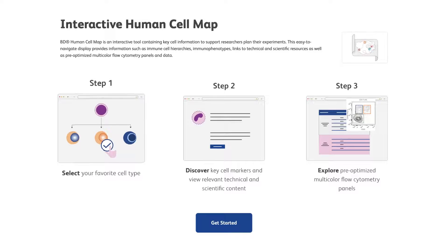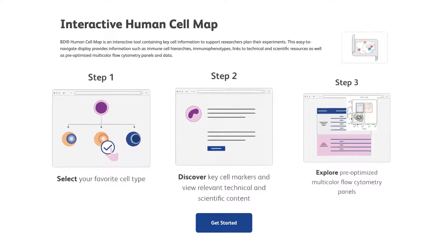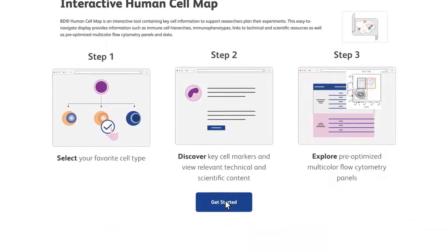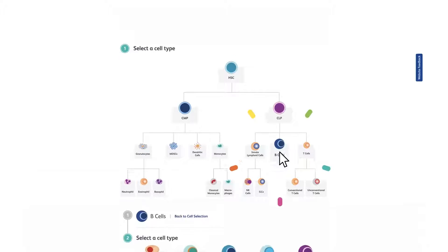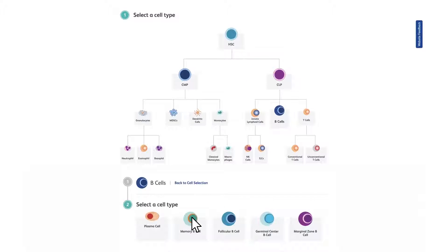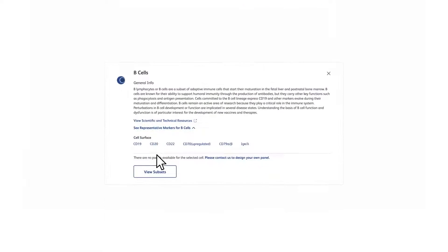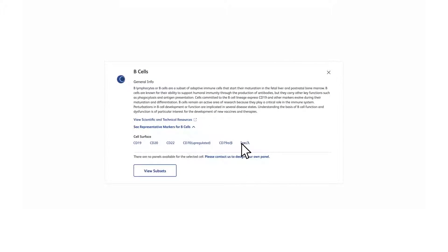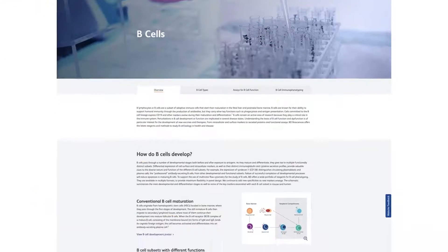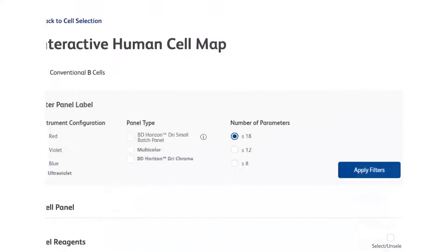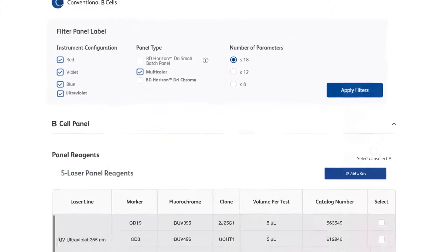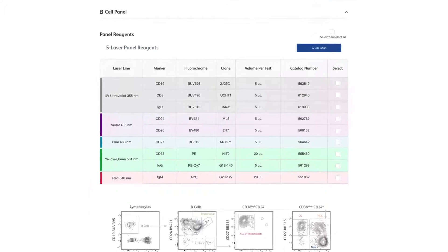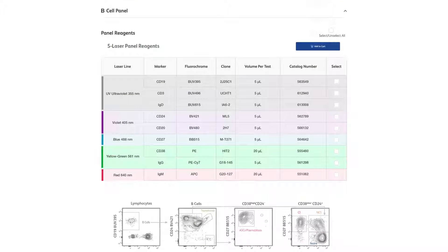With an easy-to-navigate display, the BD Interactive Human Cell Map Tool offers you key information such as immune cell hierarchies, immunophenotypes, helpful links to technical and scientific resources, as well as access to examples of pre-optimized multi-color flow cytometry panels to accelerate experimental design.